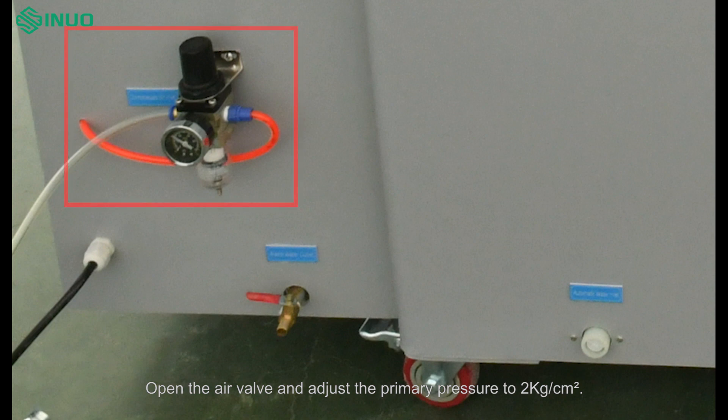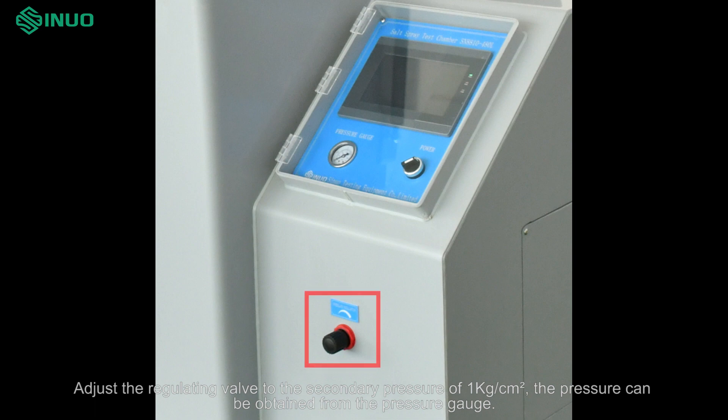Open the air valve and adjust the primary pressure to 2 kg per square centimeter. Then adjust the regulating valve to a secondary pressure of 1 kg per square centimeter. The pressure readings can be obtained from the pressure gauge.